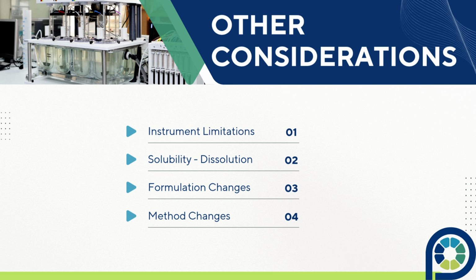Here are a few things that you may need to consider when developing your accuracy evaluations. Ensure that your acceptance criteria takes into account the limitations or sensitivity of the instrumentation used. For example, coulometric Karl Fischer is more sensitive than volumetric, so the criteria set for accuracy may be different depending on the instrumentation that you're using.